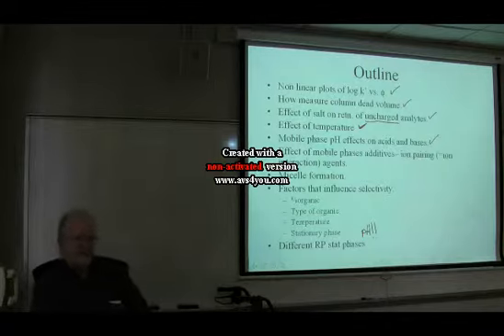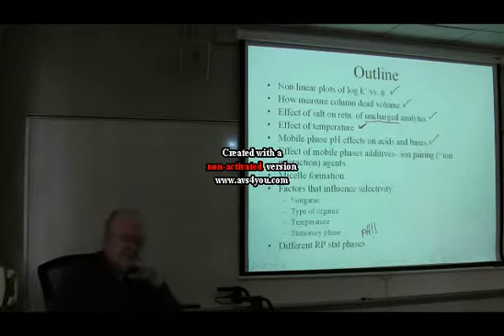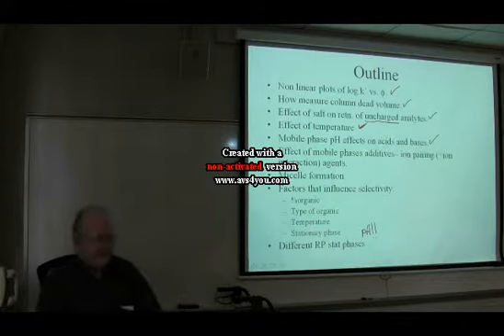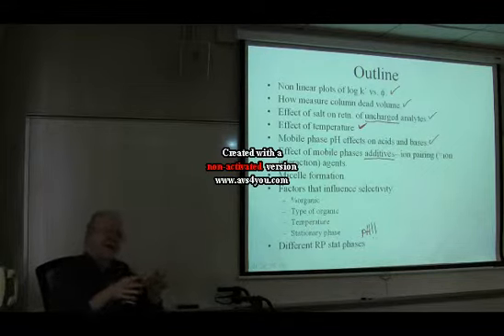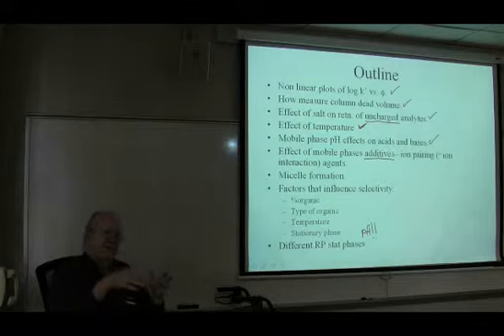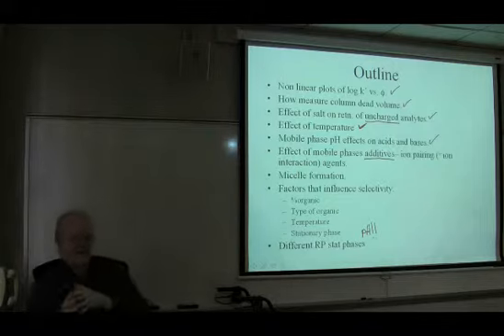If you thought I'd have everything there is to say at this point about the mobile phase, that would be wrong, because there are some very interesting things related to what we call mobile phase additives. I differentiate between a mobile phase modifier, which is a co-solvent, methanol, acetonitrile, THF, and an additive.